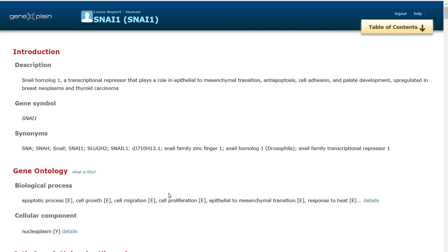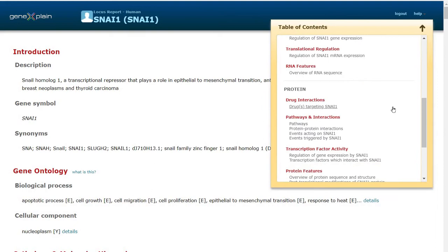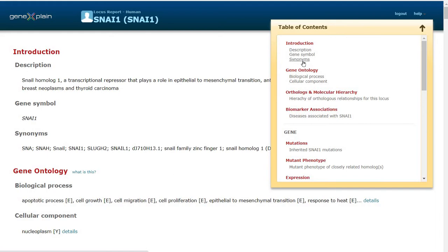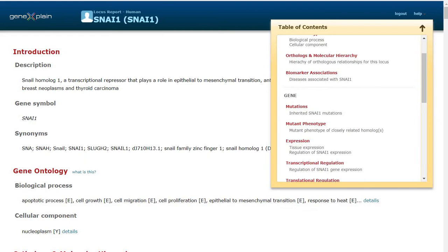Today, we will look into the report of Snail 1 in the Integrated Database of TransPath and Human PSD. Here, we have opened the locus report of Snail 1 transcription factor. Let's first check the table of contents. We can see the full details about the gene, gene symbol, synonym, gene ontology, and biomarker associations.